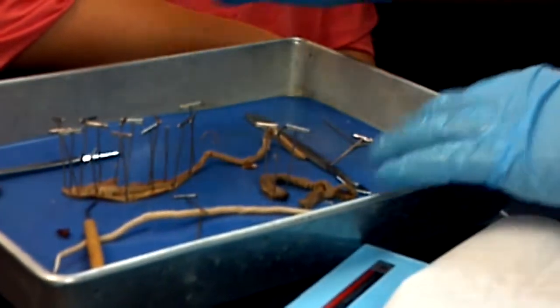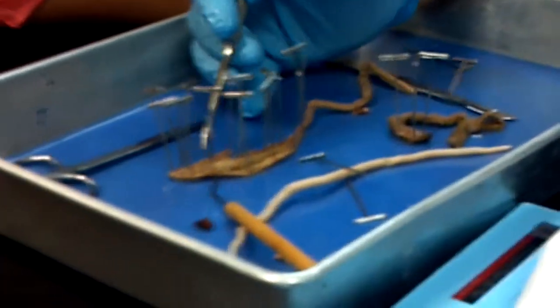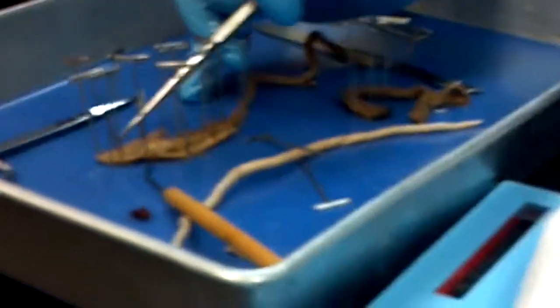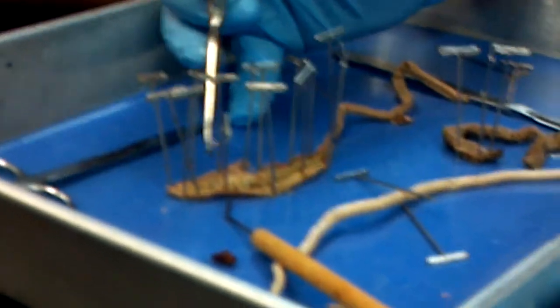And then I have the earthworm, whose main parts are pretty easy. Along the digestive tract you've got mouth, then pharynx and pharyngeal muscles right here. We've got a crop in here, and then intestine by the time we're down here.